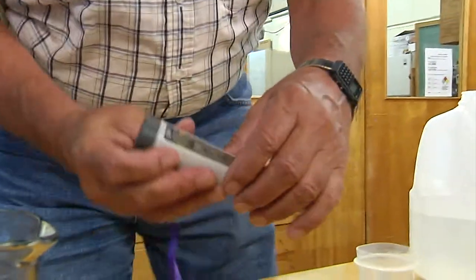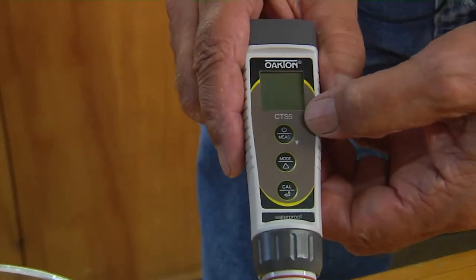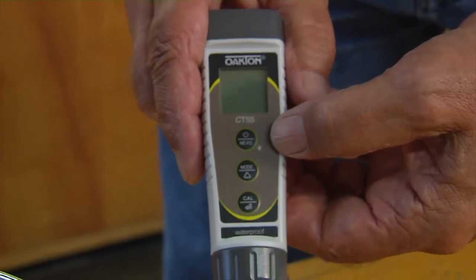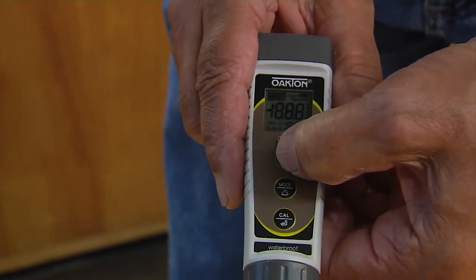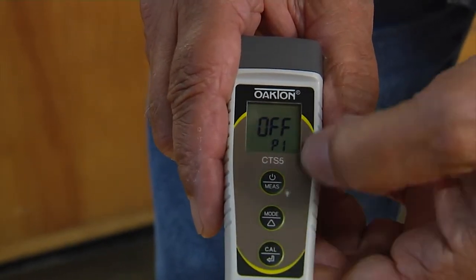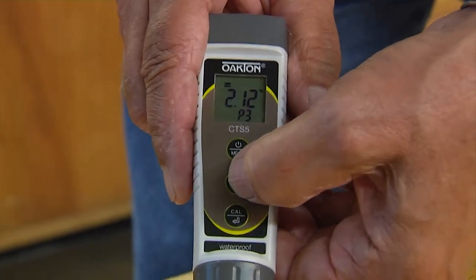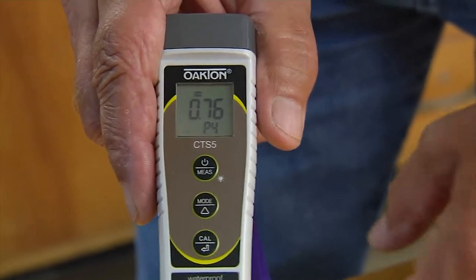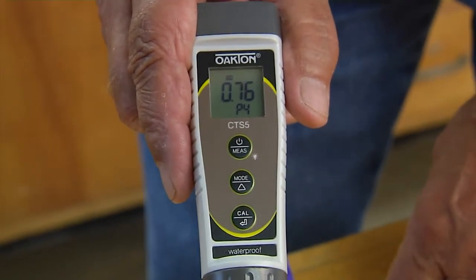Then I want to check my EC meter. On this type, I want to make sure I set the multiplier to 0.76 so that it gives me an estimate of the total dissolved solids in the water for natural water. If I hold this button and scroll down through the different settings, at P4 you can see the multiplier is set to 0.76. Every meter does it a little bit different, but you can set this anywhere from 0.5 up to 1 if you wanted to.